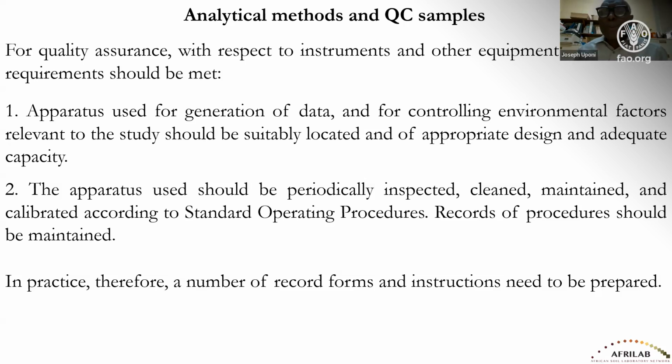How do you know that your UV visible spectrometer is working properly? We have commercial filters that you can use to check whether your UV visible spectrophotometer is working. These filters, you put them in your sample compartment and they tell you what absorbance is expected at a specific wavelength. So when you use those filters and you are getting the required absorbance, you know that no matter where your readings are taken to, if the equipment the other people are using are okay, you should get similar readings.